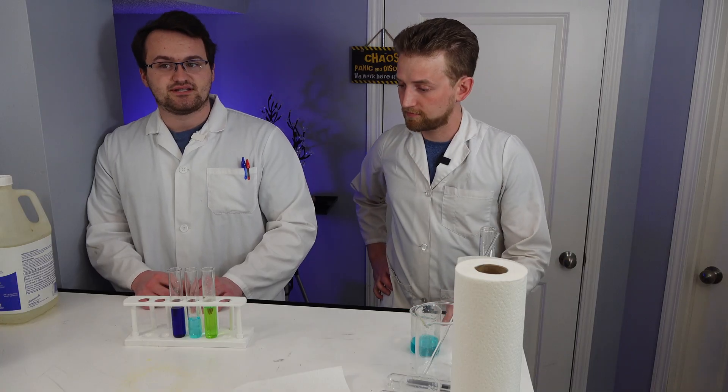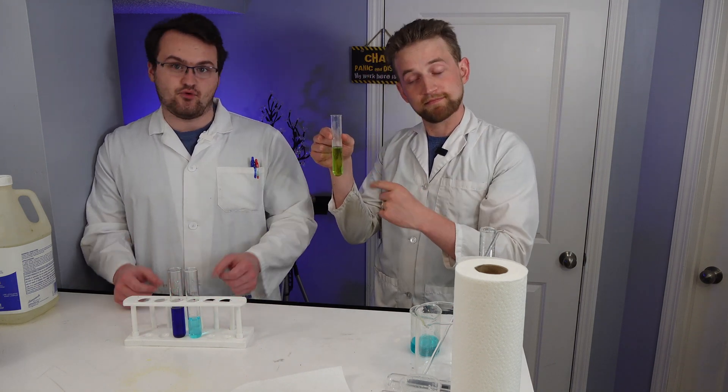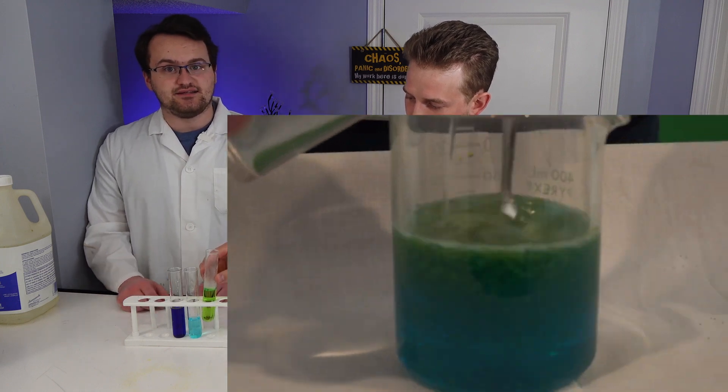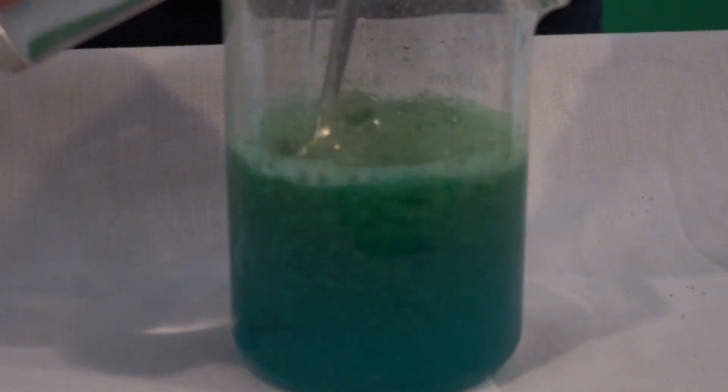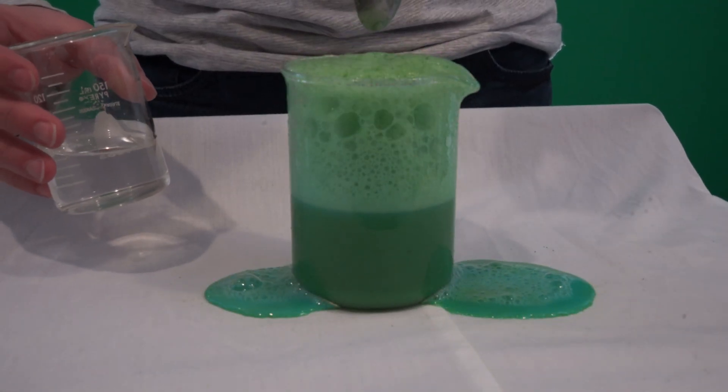So you may notice that when we were making copper carbonate, you may have seen a little bit of green forming. The reason for that is that we were adding hydrochloric acid to a copper solution, and so we were making some of this compound here. And that's why you were seeing flashes of green.